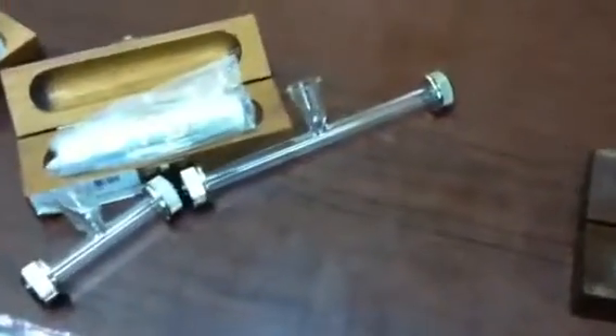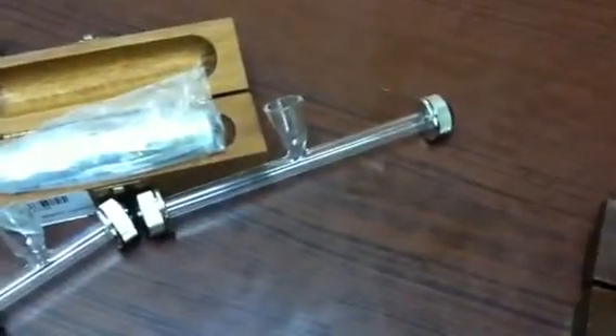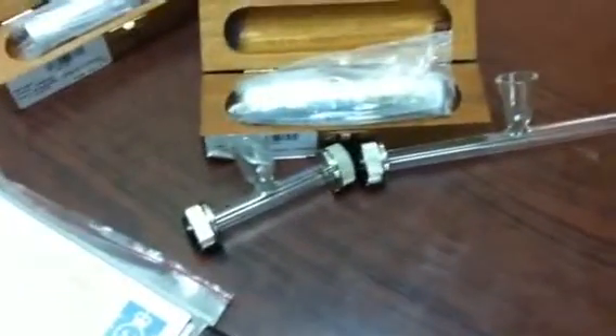We have these units in angular scale for pharmaceuticals and sugar scale for the sugar industry. It comes standard with a 200 mm glass pull tube and a 100 mm glass pull tube.